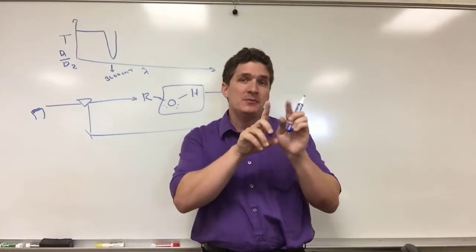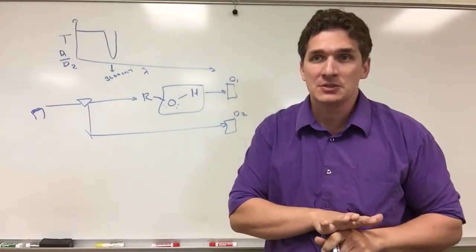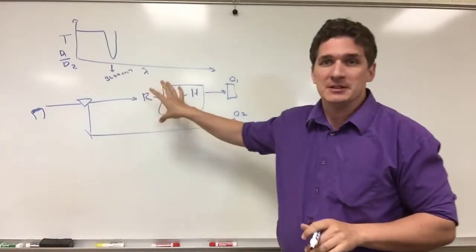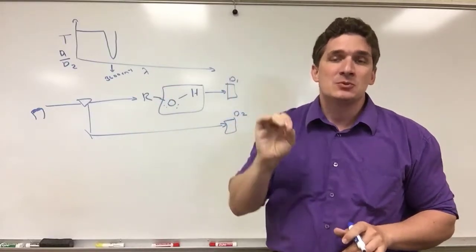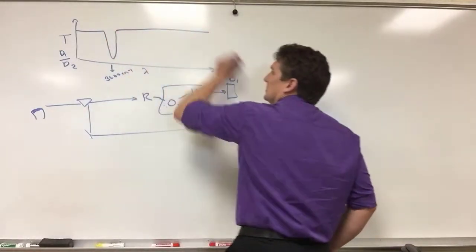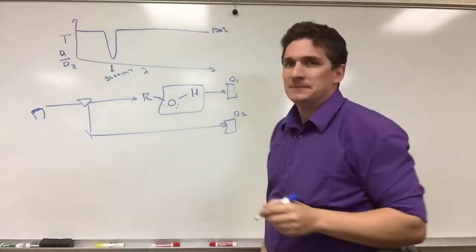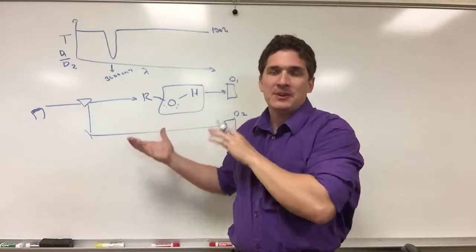So it's going to absorb in a range of frequencies that correspond to the Heisenberg uncertainty. Now, the peak is going to be at 3600. But above and below it, we'll still see some absorption because the electron's energy levels aren't precisely defined. Once we get away from it, we'll go back to 100% transmission.